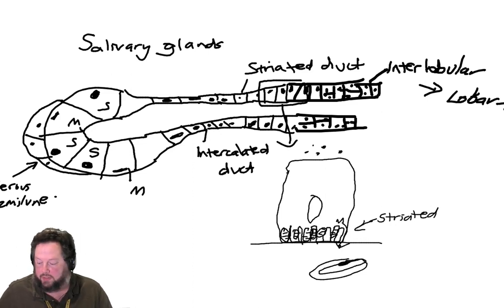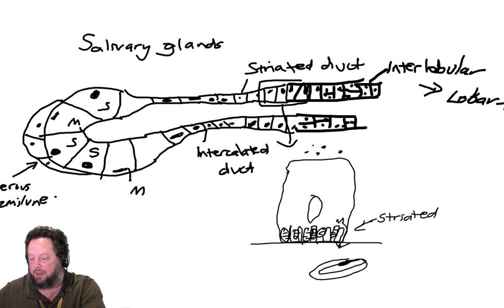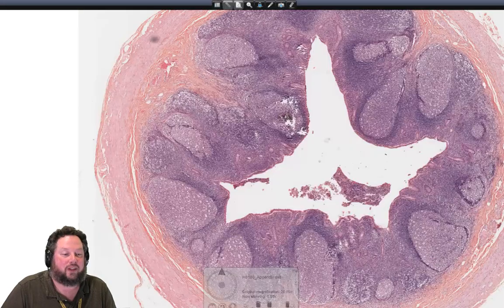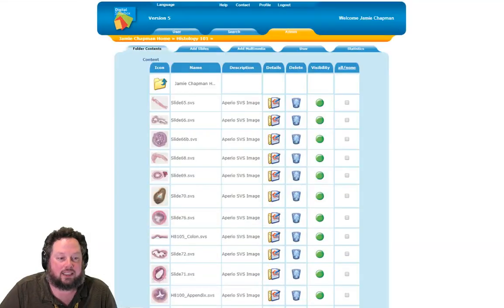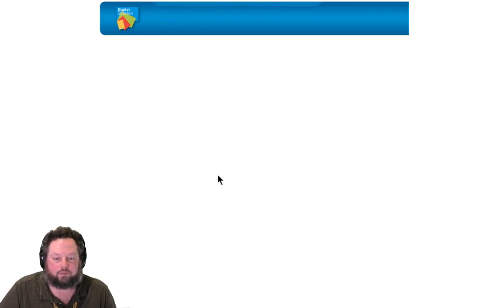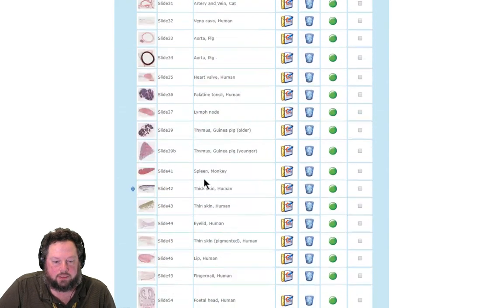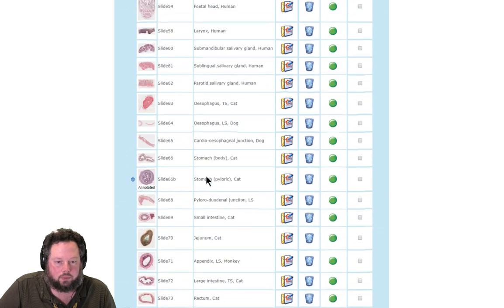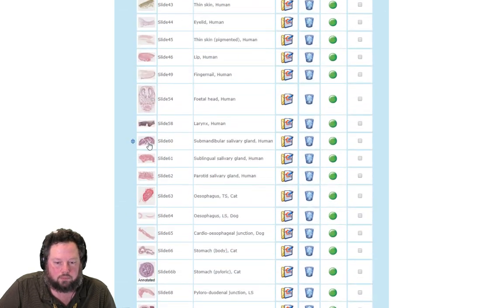That's really messy and ugly, and I apologize. So if we go back to our slides, let me go back here. Let me find a slide and I'll point those out to you. Right, let's go down. Oops, gone too far. Yeah, we'll have a look at this one.